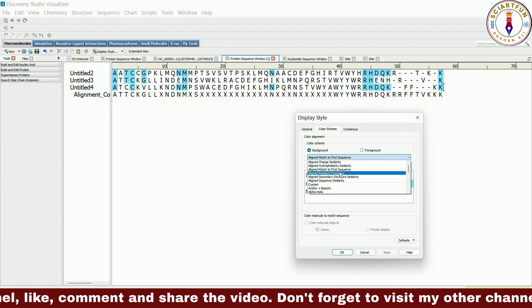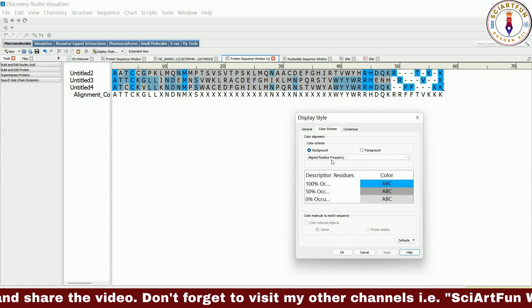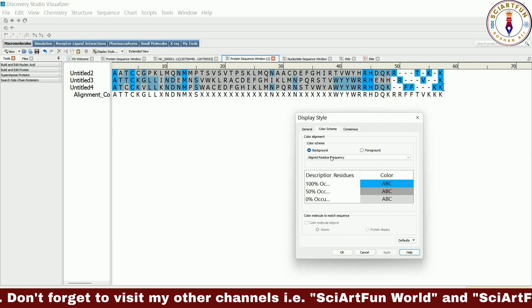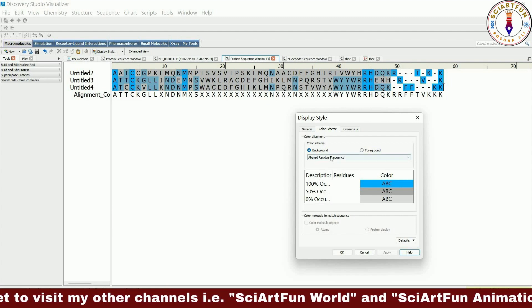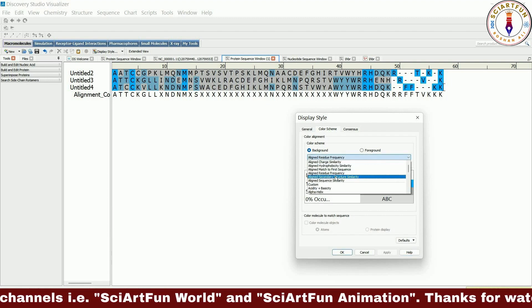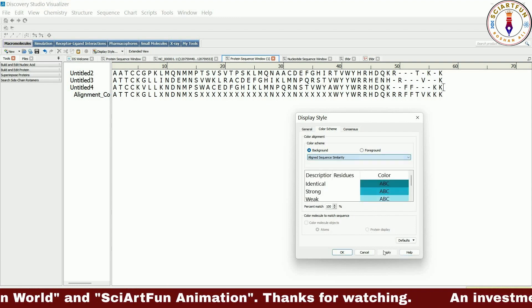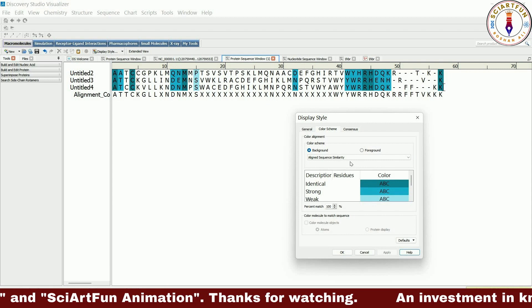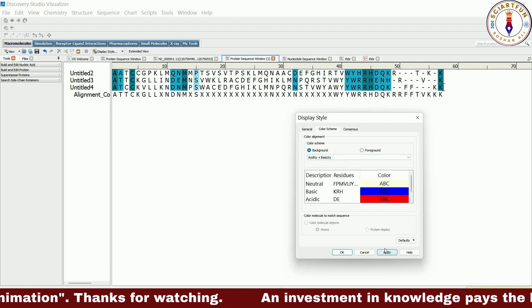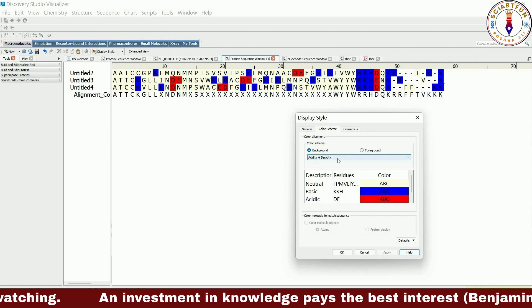Another option will color only those residues which match the first sequence in the sequence alignment file. If the residue is identical to the first sequence residue it will be colored blue, otherwise it will remain colorless. Another option colors based on the frequency of residue matching: 100% match means the column is colored blue, 50% match means dark gray, and 0% matching will be colored light gray. There is also an option to color columns based on secondary structure similarity or sequence similarity. The acidic residues will be colored red, basic residues blue, and neutral ones light yellow. One option will color based on alpha helices.